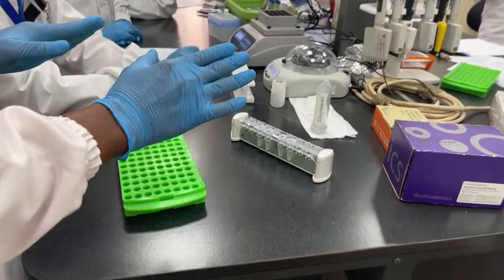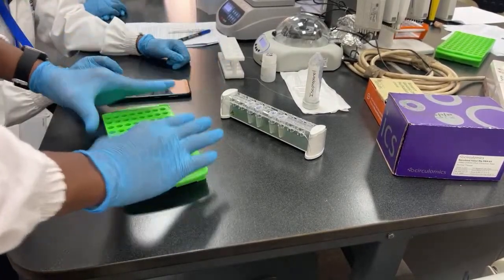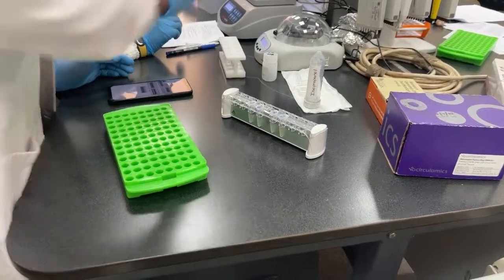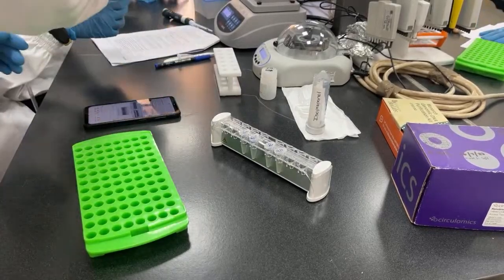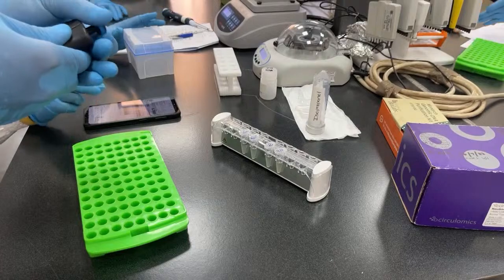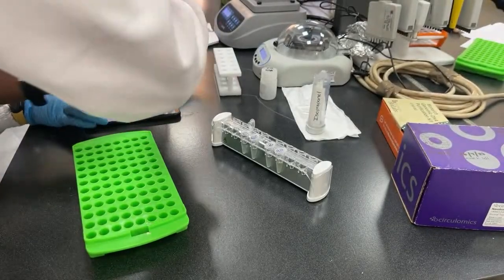Because I'm going to do this. We've come so far to lose the DNA. What's the protocol step? Discard the supernatant. How much is the total volume? 3 plus 2. I need a P1000. I haven't done this in a long time.